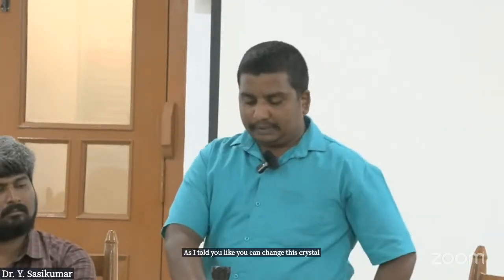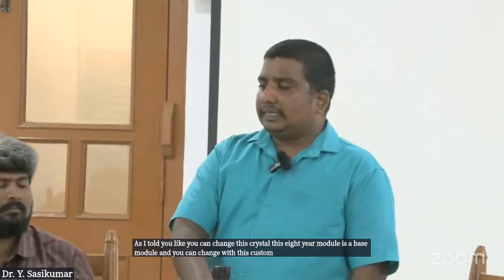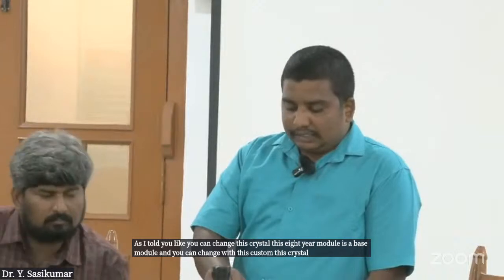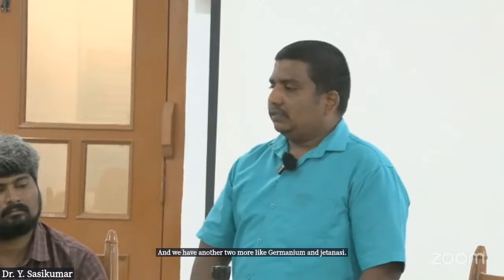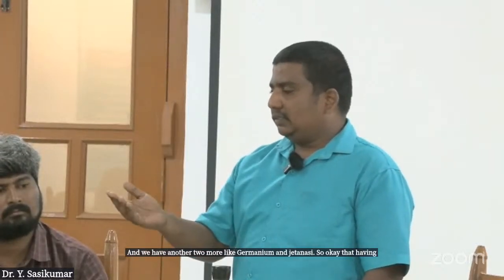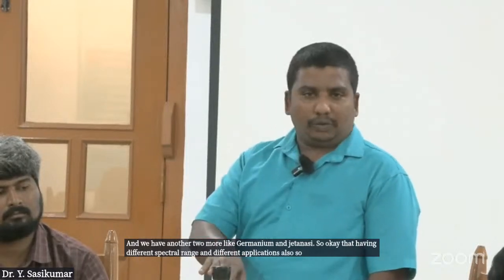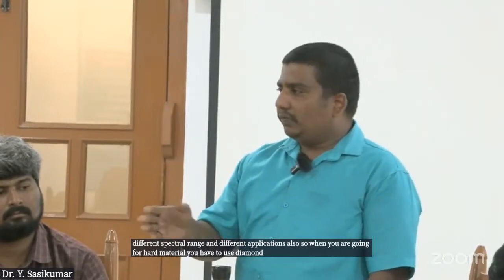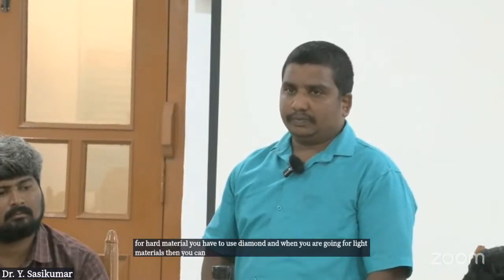So as I told you, you can change this crystal. This ATR module is a base module, and you can change it with this crystal. This crystal is a diamond, and we have two more, like germanium and zinc selenide. They have different spectral ranges and different applications also. When you are going for hard material, you have to use diamond, and when you are going for light materials, then you can go with zinc selenide also.